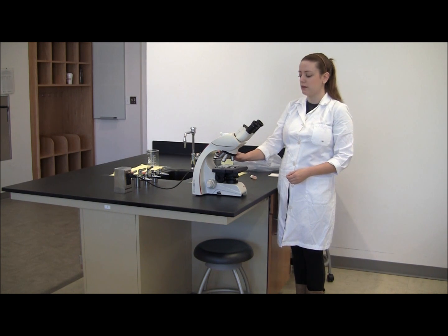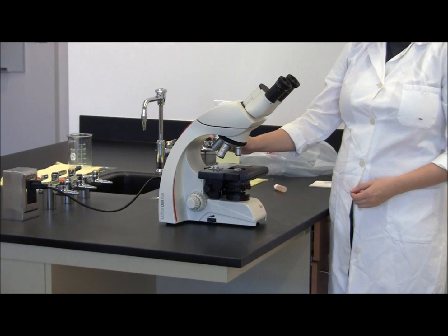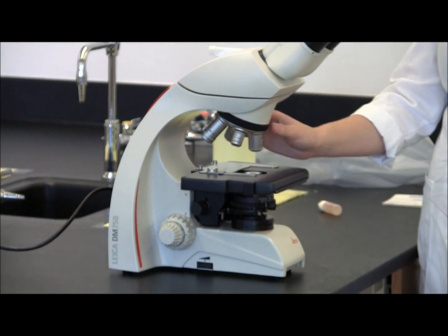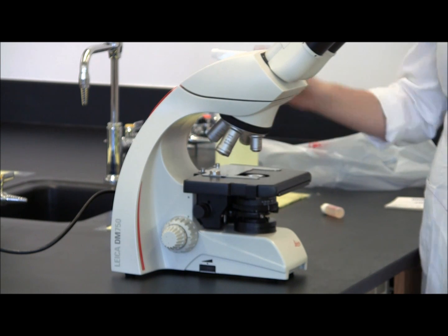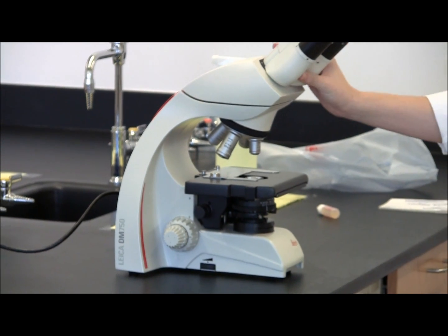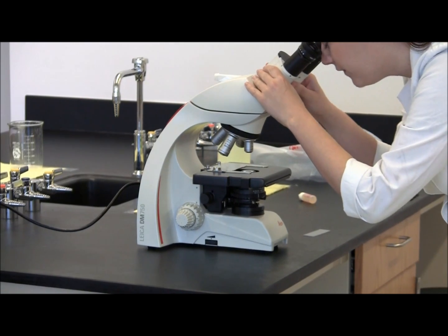These are your objectives in the microscope. When you're switching between objectives, you should never grab the actual objective. You should only use this wheel to move the objectives. These are the eyepieces of the microscope. You can adjust these to accommodate your eye width.